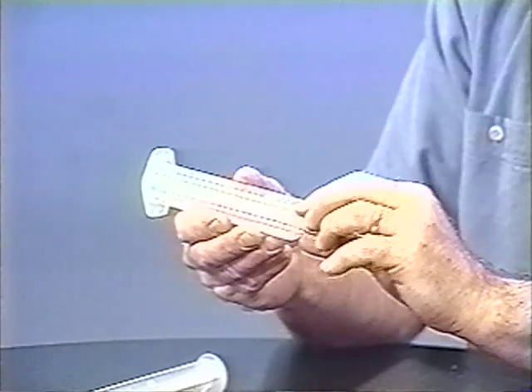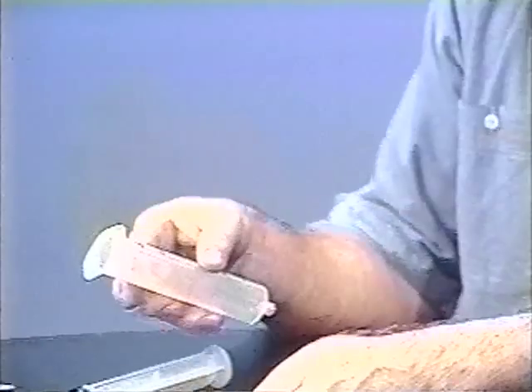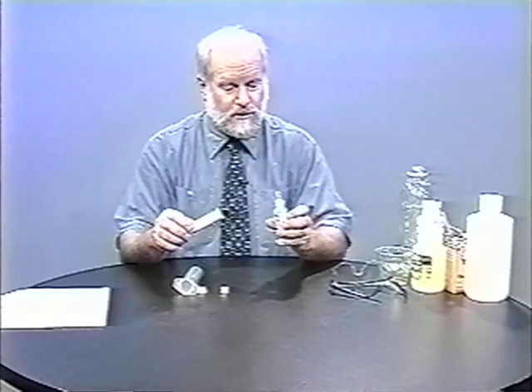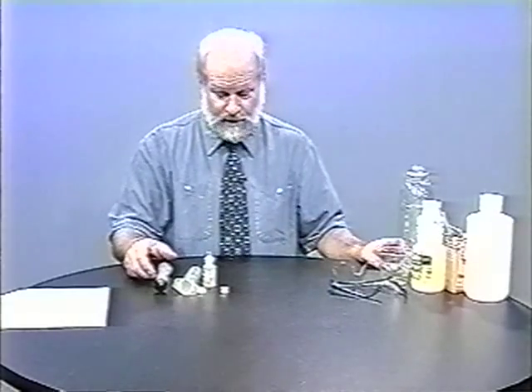And a latex syringe cap. These snap or twist on the end of the syringe, and they're absolutely gas-tight — they're fantastic little things. You also need some sort of a way to lubricate the diaphragm on the plunger, and I just use vegetable oil. It's cheap and easy to clean up.